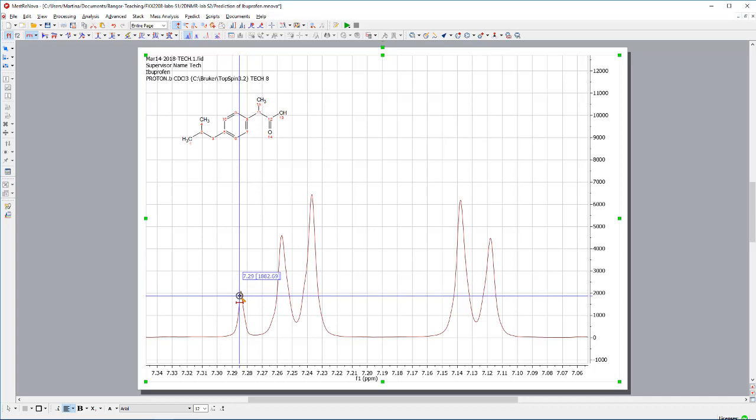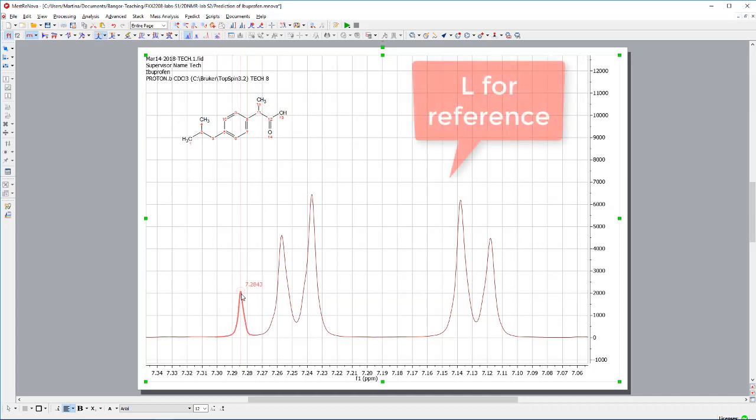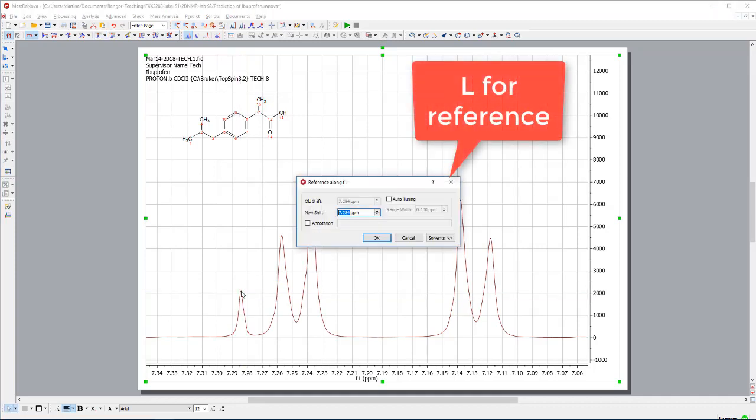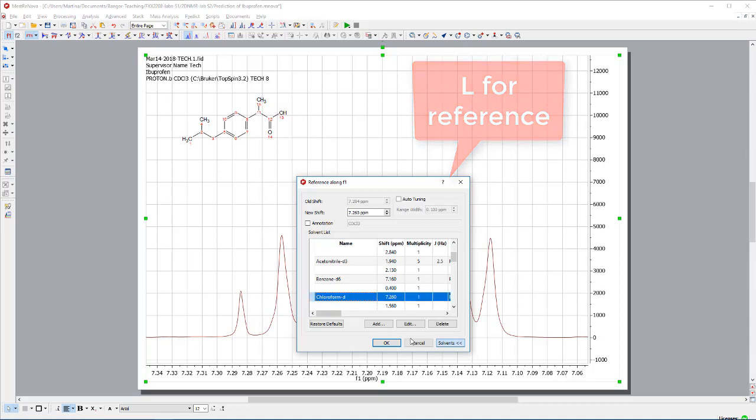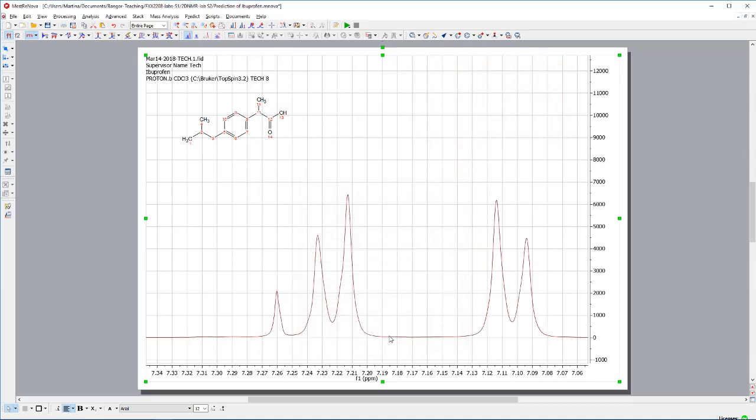I have pressed the letter L, that will open up my calibration window. I select chloroform, proton NMR and say OK. So, now this calibration should have been done. I can go back to the full view of the spectrum.